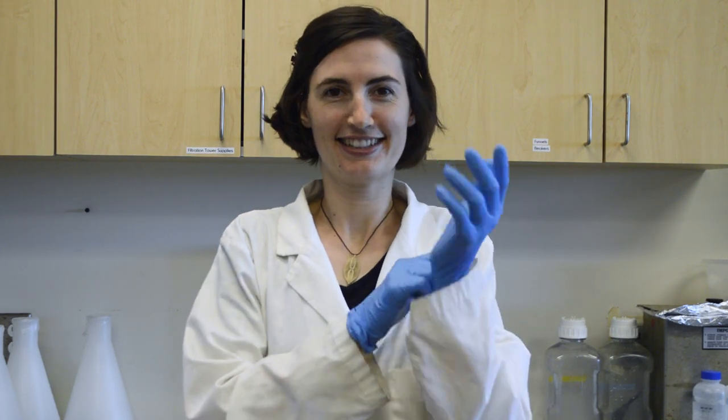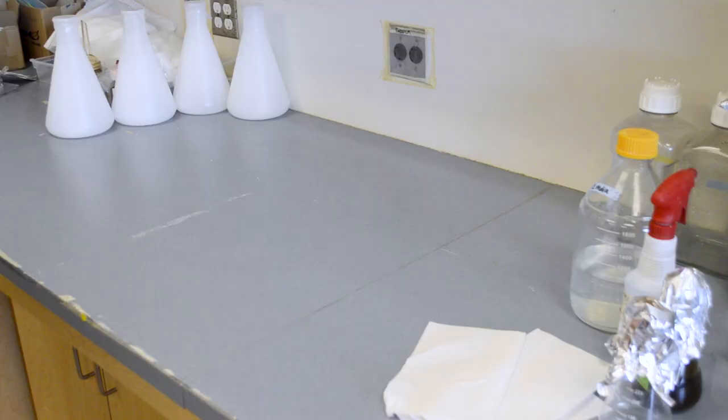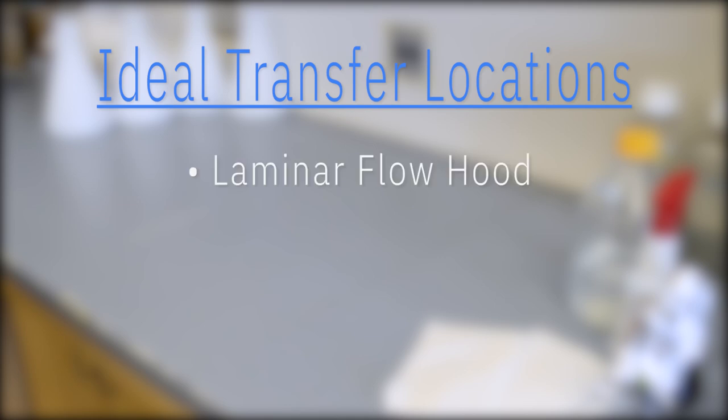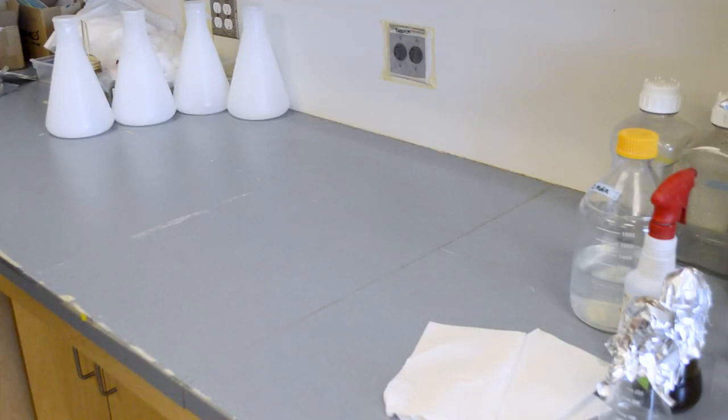Next we will prepare our workspace. Ideally cultures should be transferred in a laminar flow hood, transfer cabinet, or clean room to minimize contamination from the surrounding environment. If none of these options are available, do your best by choosing a bench away from foot traffic and airflow and then cleaning it.